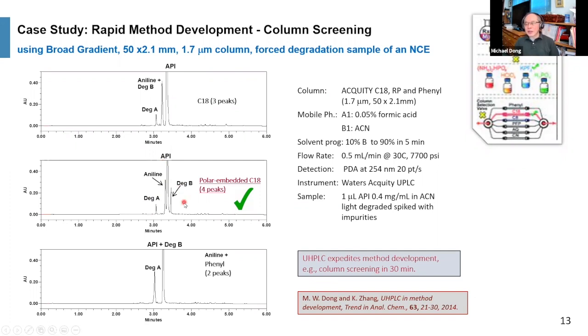In method development, you're always looking for a method or condition that allows you to have more peaks, more separation. Something like that, even though it looks very pretty, is bad, because 2 of the pairs are co-eluting. It looks actually perfect, so without comparing it, you don't know. This is a kind of tricky separation. So right away, we know polar embedded is better, and I will use a longer polar embedded column from the same manufacturer to develop the method.